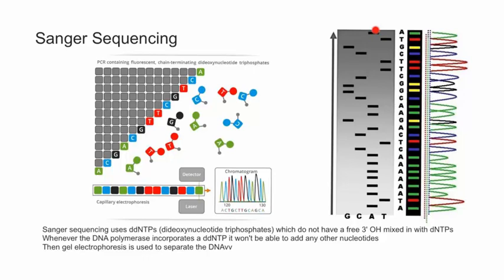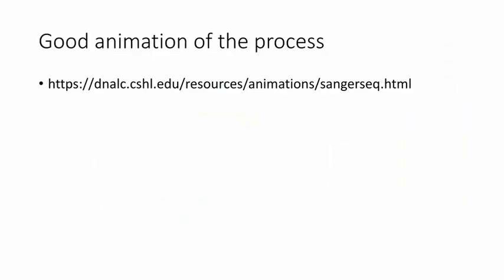Now, this does not include next-gen sequencing. That is a separate lecture. Here's an animation of the process if you're interested.